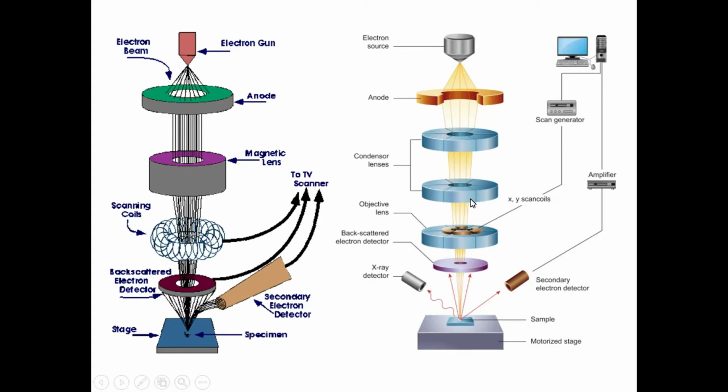Next, when we talk about the chamber, we will see how it looks. The signal from the chamber passes through the objective lens, objective aperture and the object; we will see those other things, not an issue. The condenser lens we have seen. Inside the objective lens we have XY scan coils, where it is going to move, and we check in what directions we are going to focus, or which one we are going to focus.